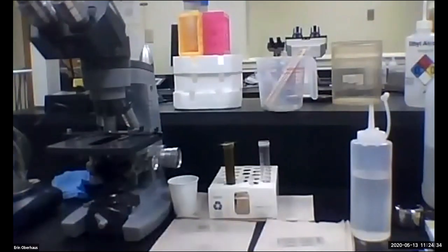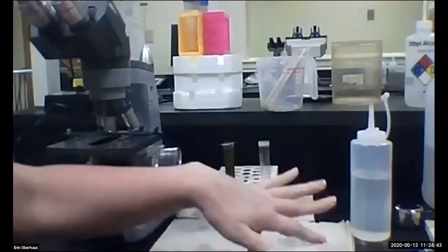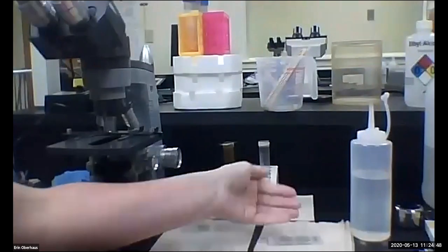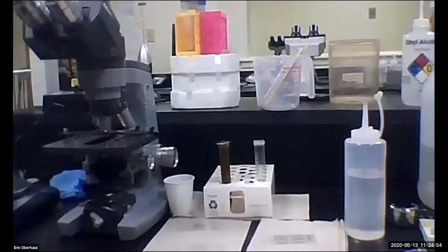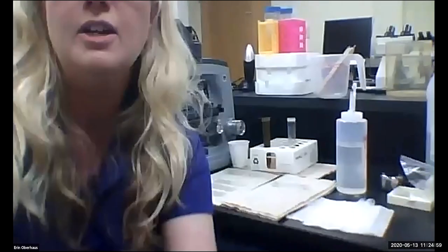And the goal of letting it sit is now you're letting all of those eggs rise to the surface and then can be visualized. In this case, they're going to stick to the cover slip, and you're going to put that on a microscope slide and then visualize it under the microscope. In the case of the McMaster slide, you're going to let those eggs rise to the surface and make them more visible. So while that's sitting, unfortunately, I don't have the technology here to let you see under the microscope what I'm looking at, but I do have some pictures.